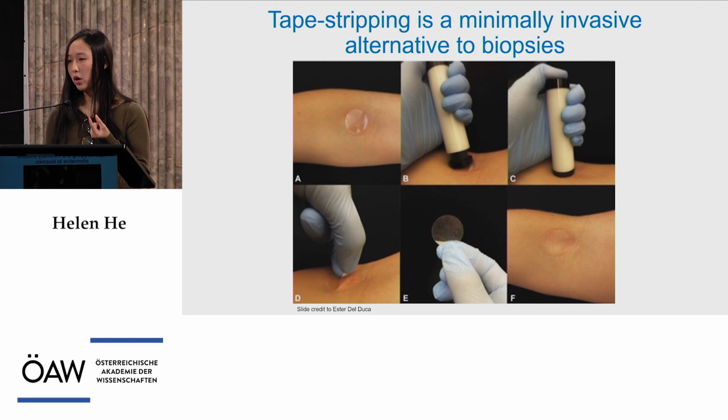So now I want to reintroduce this concept of tape stripping, which is a minimally invasive skin sampling technique in which tapes are repetitively applied and removed from the same area of skin with standardized pressure, and then the material from those tapes can then be analyzed using various omics platforms. Unlike biopsies, tape strips are painless, they don't cause infection or scarring.